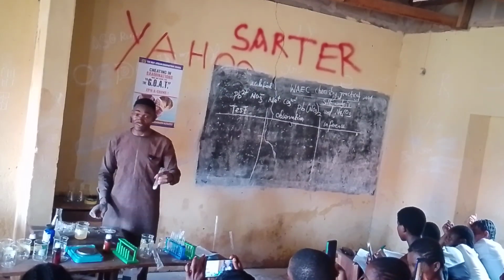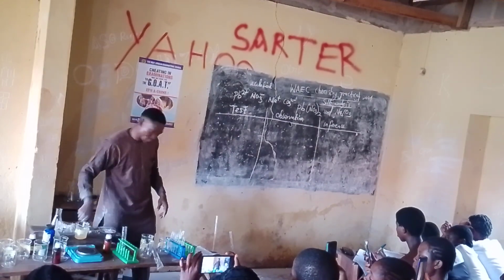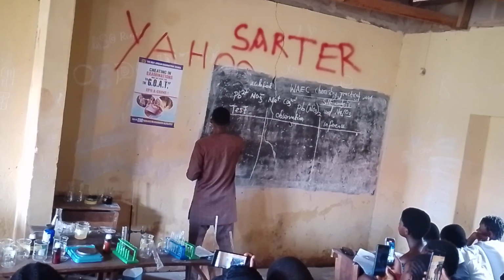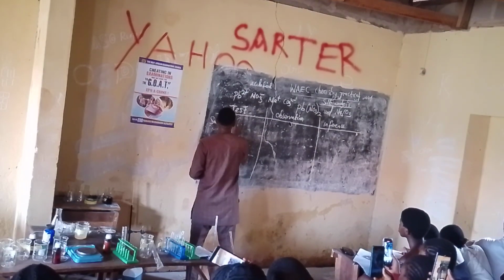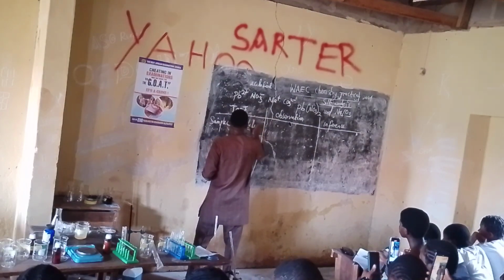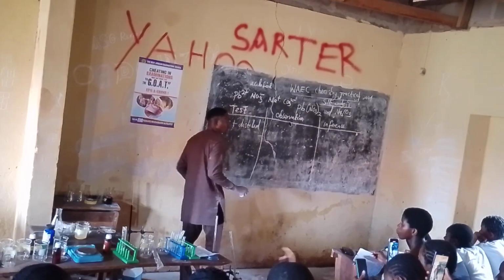So when he brings it, we are going to add the water. So let's report together. Sample C plus distilled water. Sample C plus distilled water.